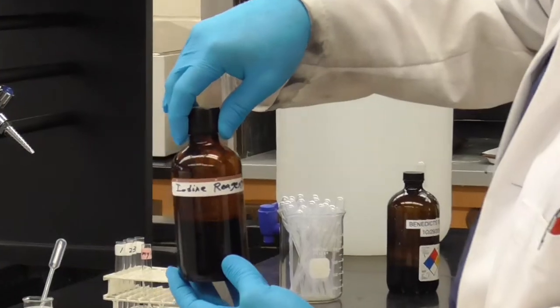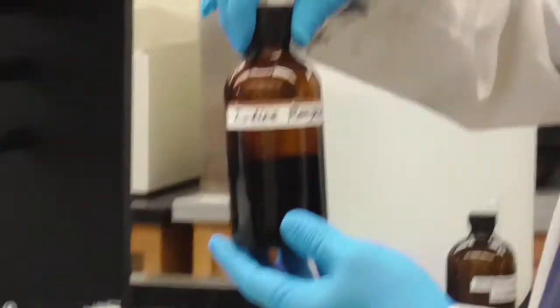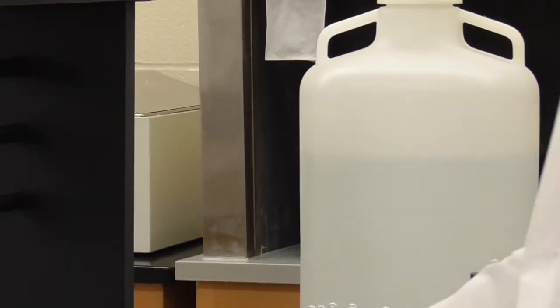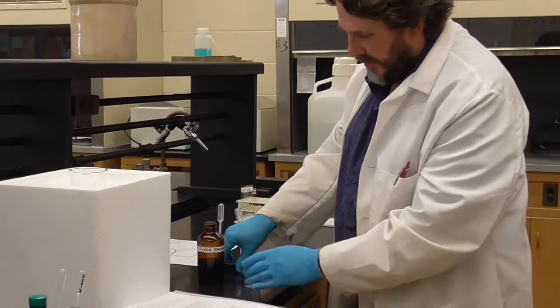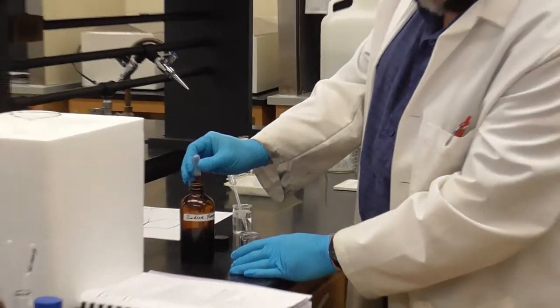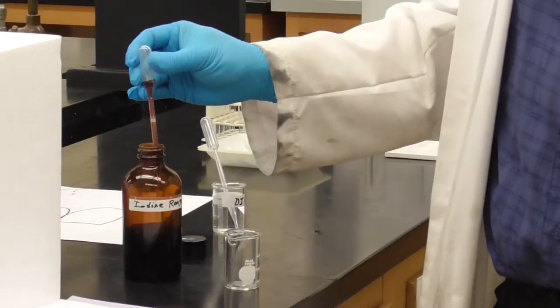All right, so we have our amylase solution, and then we have our iodine reagent over here. Step 4 says, obtain about 1 milliliter of iodine and add 1 milliliter of water. So we want to dilute this, 1 water and 1 iodine. So let's just go ahead and do that right now. I've got a little beaker here that will keep our iodine solution in. We don't need a lot of this. Remember, the iodine is just the indicator to tell us whether we have starch present or not.